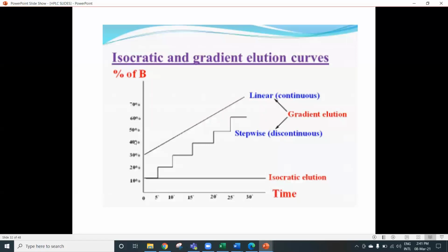You can see here now that you have a solution of maybe 10% of B and 90% of A. And from the beginning of the run till the very end, your composition is maintained. Then for gradient elution, it can be linear or stepwise. In the linear, it just starts here, and every minute there will be an increase in the composition of your mobile phase. Whereas in the stepwise one, you have a series of isocratic levels.